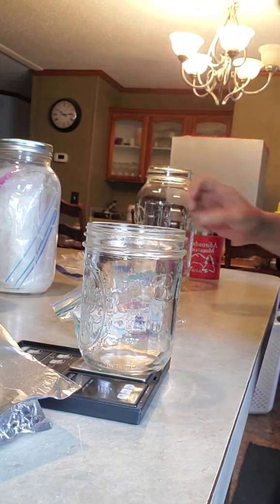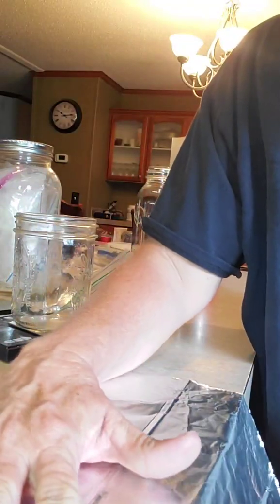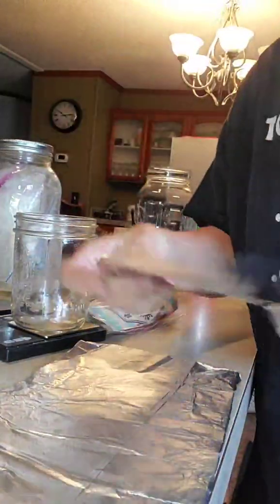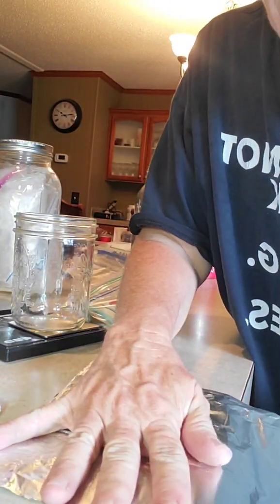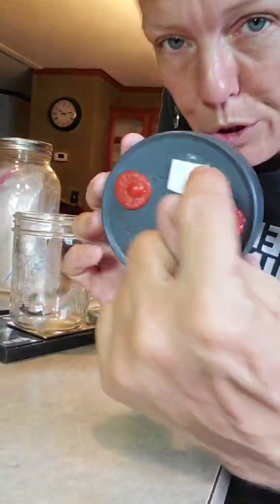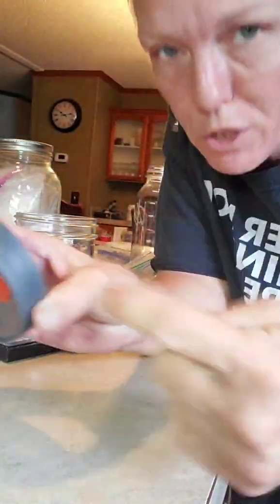When you're doing this, you want to get this in the pressure cooker. My water is already boiling over there in my pressure cooker. So, these tinfoil sheets, and I've gotten good enough at this now that I can rip tinfoil on the counter. If you're quick enough, you can rip it. Those tinfoil sheets you can get at the dollar store. What this is doing is when the jars are in the pressure cooker, it's preventing extra moisture from falling down in here and adding too much liquid to your agar.